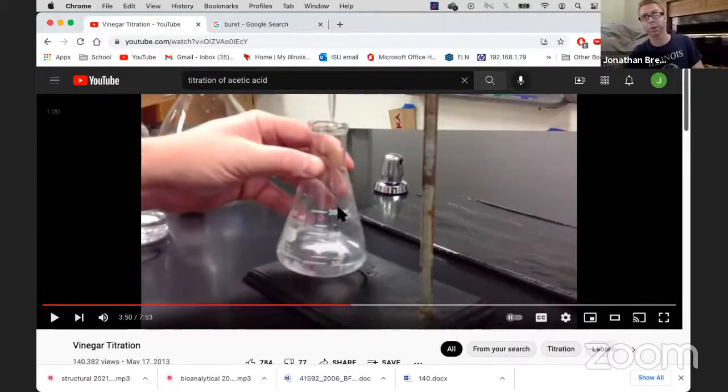He just swirls it with his hand the whole time in this video. You guys are going to have a stir plate at the bottom of your ring stand, and you have those little pill stir bars that you can put in there. It makes it just a little bit easier. You don't have to keep hand swirling things while you're going along. So you'll put the stir bar in here and have it on your hot plate or stir plate and have it spinning so that it spins it for you.